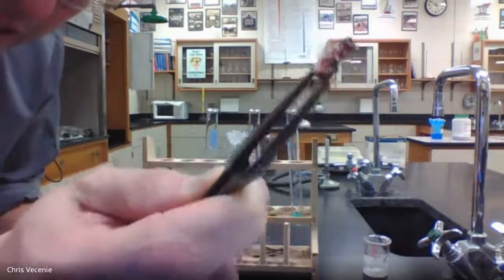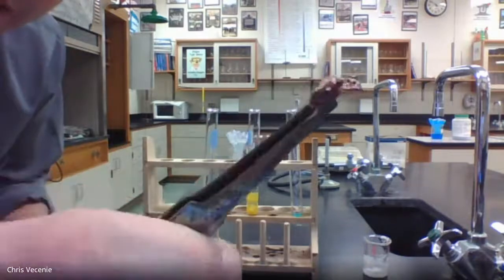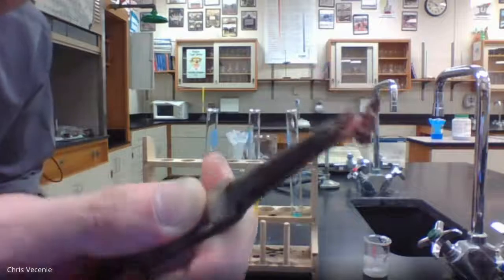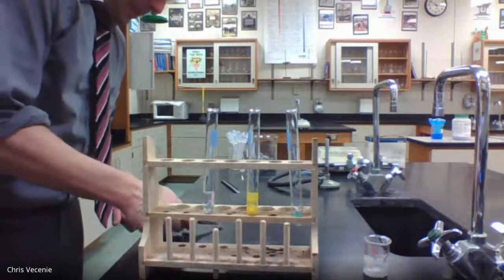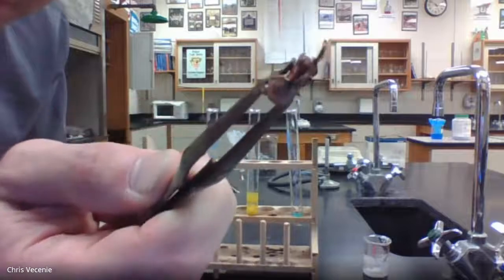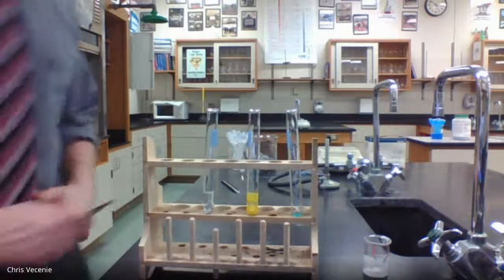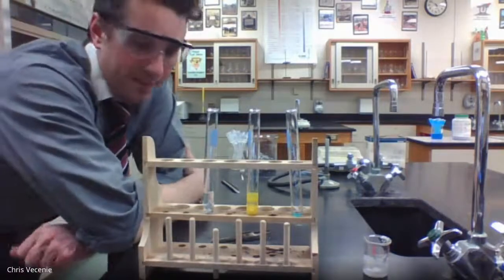And you can see it has definitely taken a change here. I would describe this as a pinkish solid that is now on the surface of my metal, and there's the other piece that was in there. So your observation there would be pink solid formed on the metal.